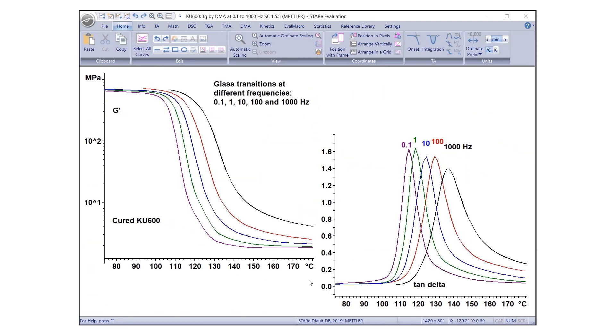Multiple curves displayed in the same evaluation window can be positioned vertically or in a grid, and they are easily switched using the coordinate functions found under the Home tab.